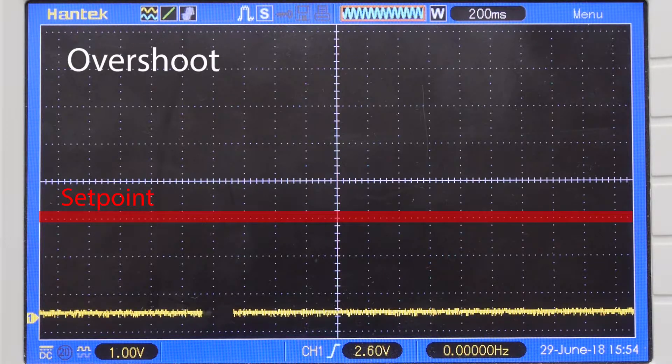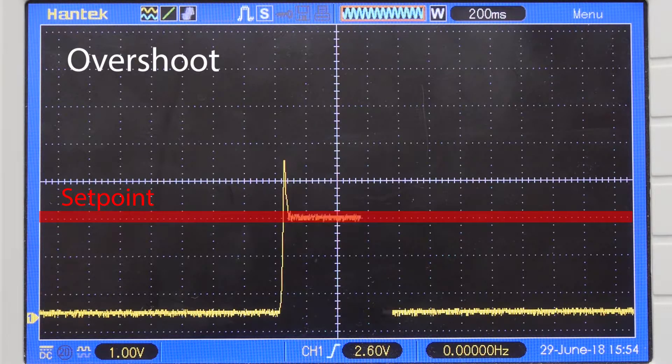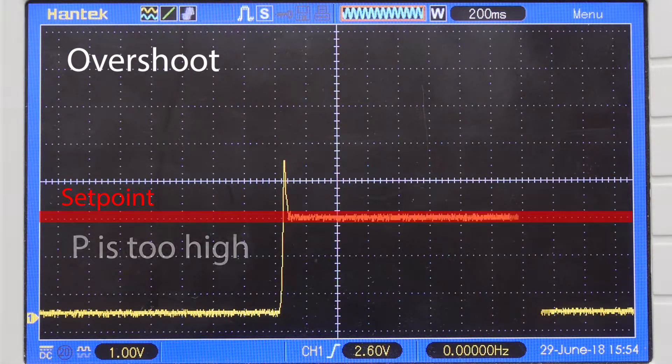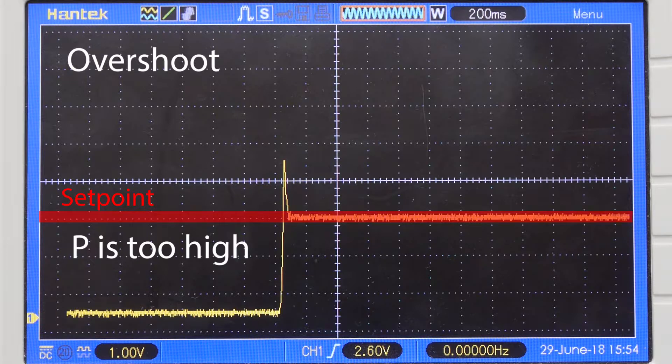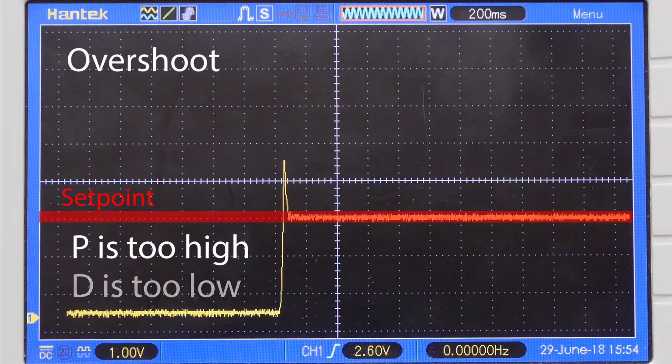If your flow controller overshoots your setpoint, this means your P setting is too high and/or your D setting is too low.